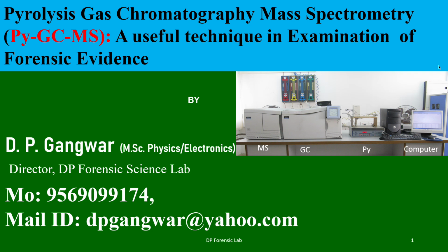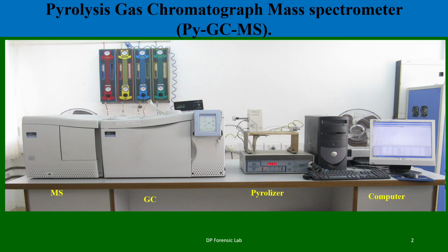Today in this video I will discuss a very useful and advanced technique, PyGCMS, pyrolysis gas chromatography mass spectrometry. This is a very useful and advanced technique. I will discuss its applications in this video. So first, what is PyGCMS?